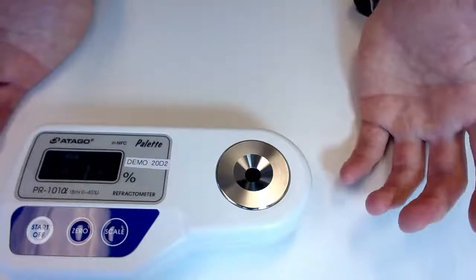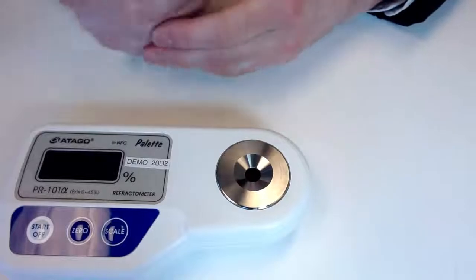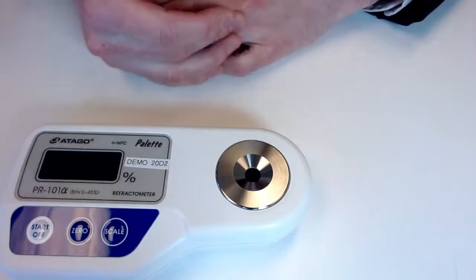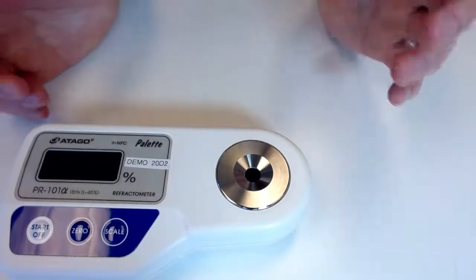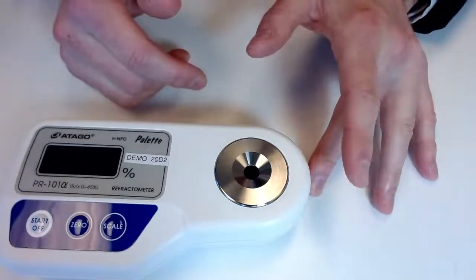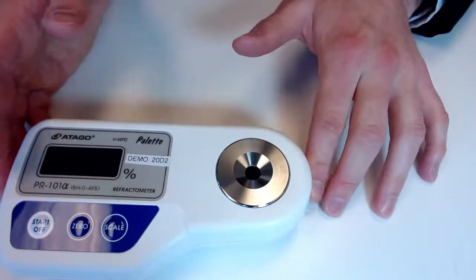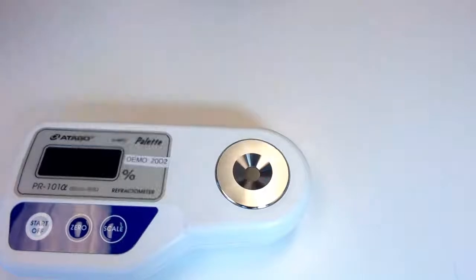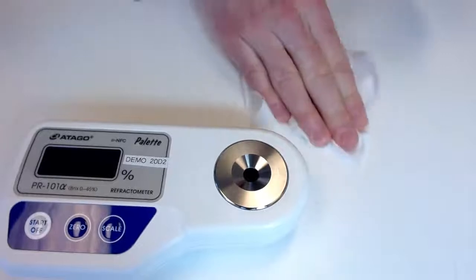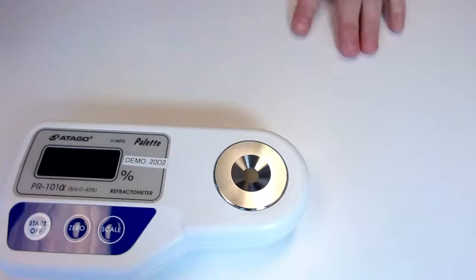The reason that you would do this in most cases is if you're using titration, you've historically used titration and you're looking to match those values. So for example, if you are 8% higher on a consistent basis with this instrument versus what you've seen in titration, what we can do is modify that coefficient to represent the sample readout that you are anticipating. That is usually when it comes into play. You can also subtract or add a specific value as well.